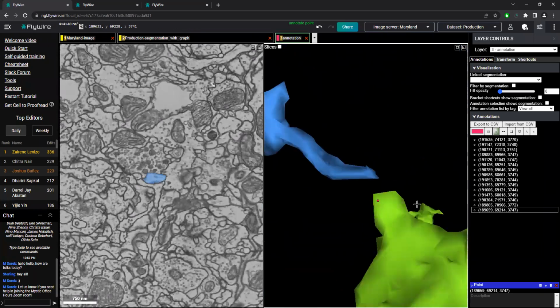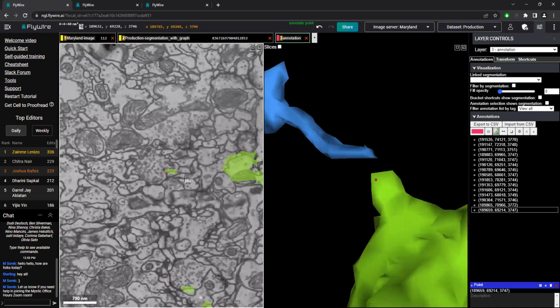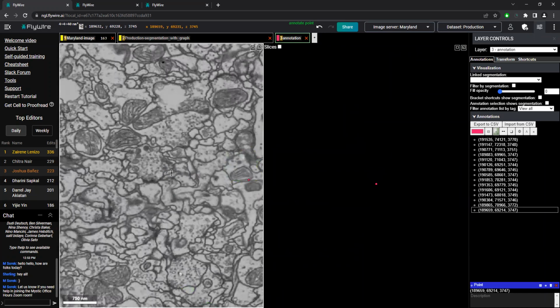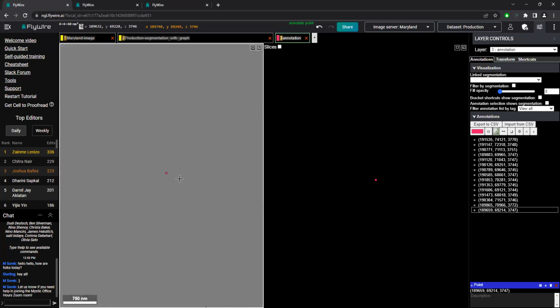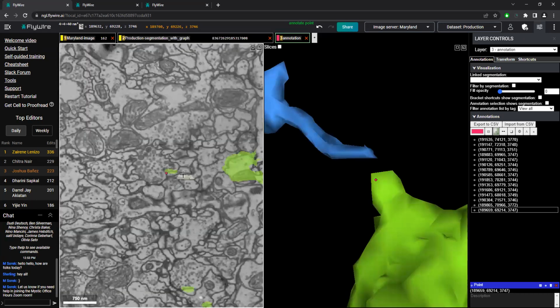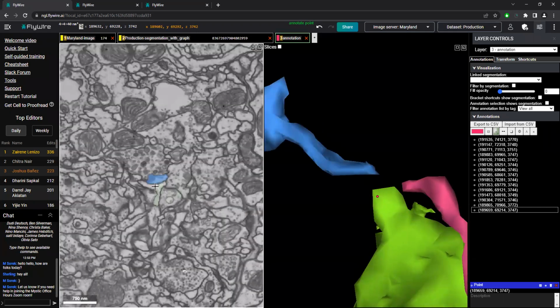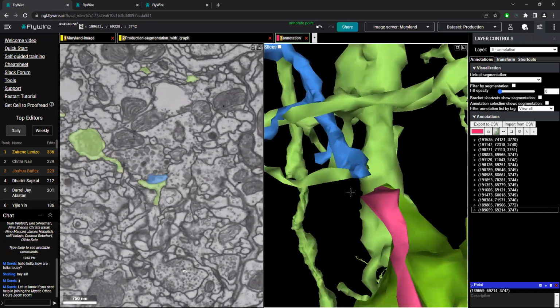The other way we could do this is we could try selecting something near it. We know that when this starts, there's this L-shaped piece that's going to come along underneath it. Right here, we're seeing that start to happen underneath this green part, even though it's not perfectly colored, but you can see if we turn off the color on the 2D, kind of where that's moving. So, turn that back on. I'm just going to select this real quick and see, all right, it's also having a similar cutoff. But if we add this, does that look like that?